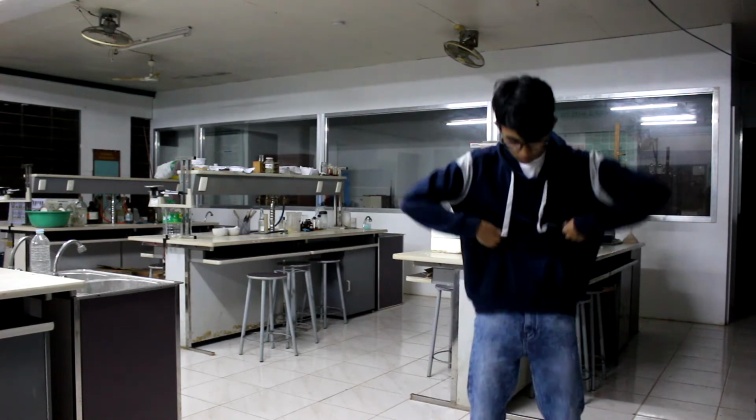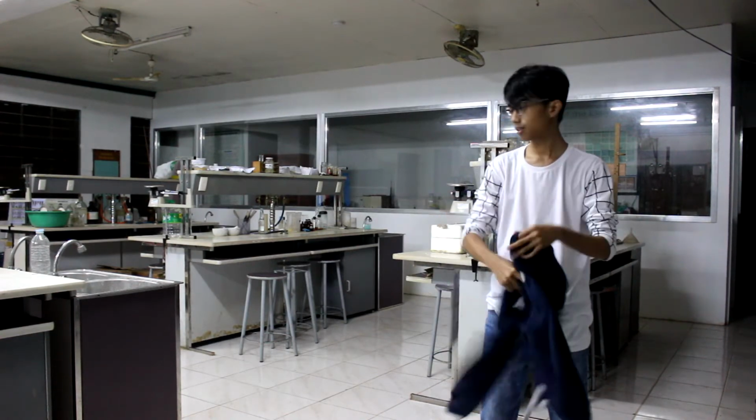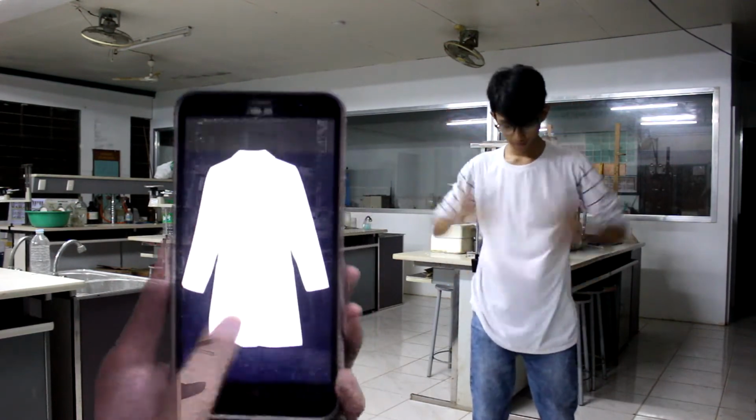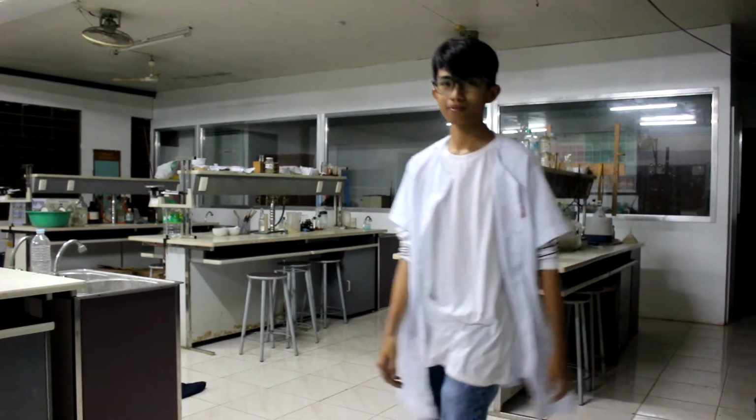But first, take off the jacket. Second, wear your lab gown. Third, wear your gloves, eye protection or goggles, and a mask.